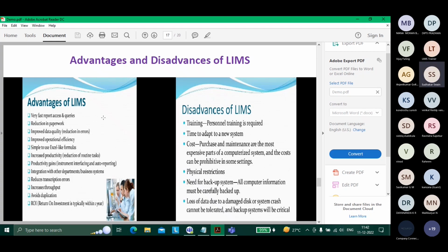Sir, if we join this course, we should get some benefit in terms of recruitment. Sure, I will touch on those technical aspects. You don't need to worry about this. I will touch on the static data and how some table structures are linked. Even if I have time, maybe I'll discuss some LIMS basic formulas and basic code, because the first question the interviewer will ask you is: do you know LIMS basics? Do you know some of the functions? At least tell me two or three functions.